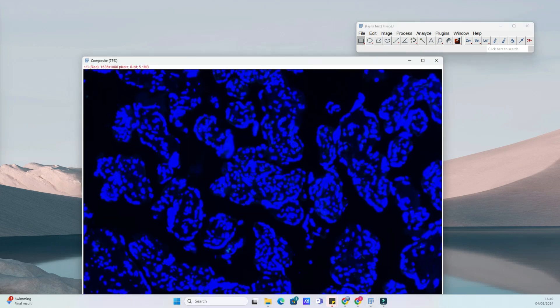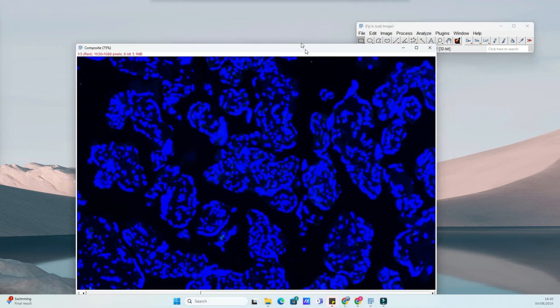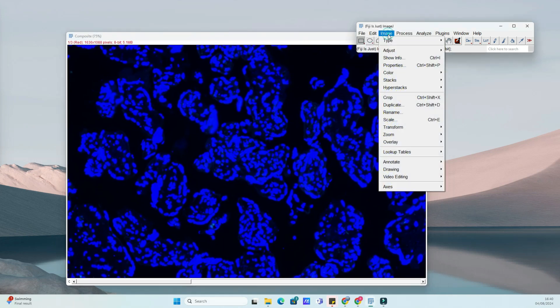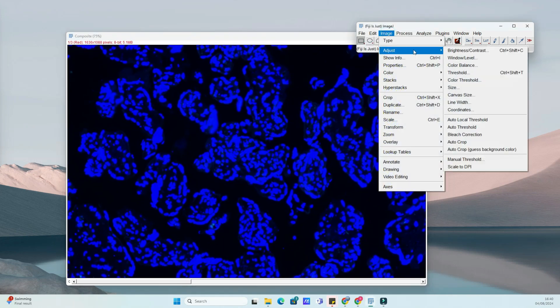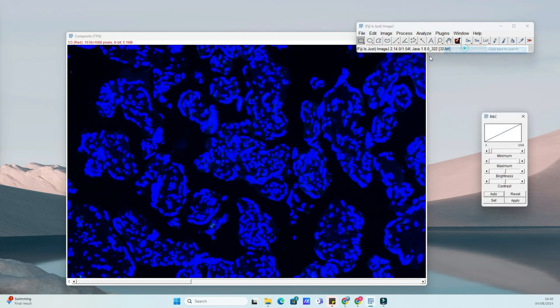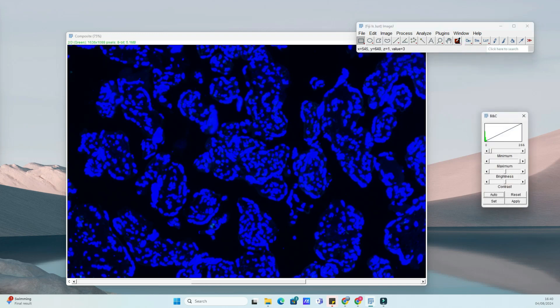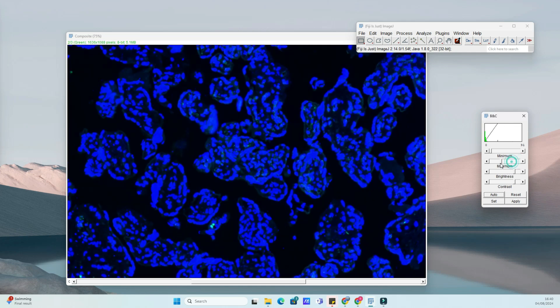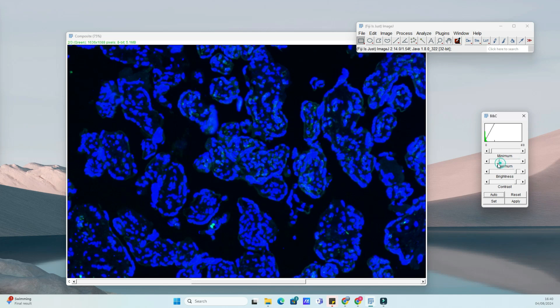Next, we'll merge these channels into a single composite image. Go to Image Color Merge Channels. In the Merge Channels dialog box, you'll see options to assign images to different channels. Set the green image to the green channel and the DAPI image to blue channel. Leave the red channel empty if you don't have a red image. Click OK to merge the images.